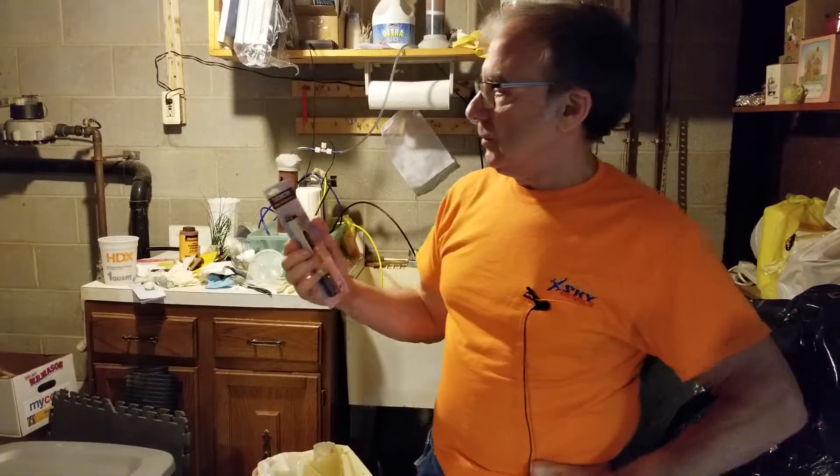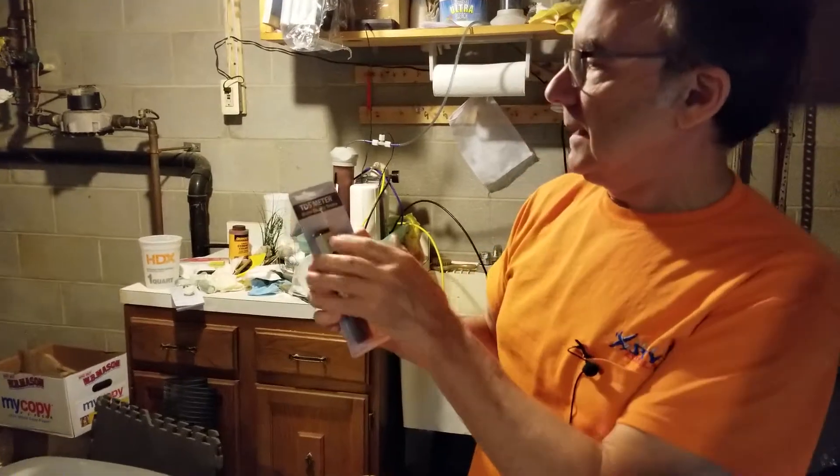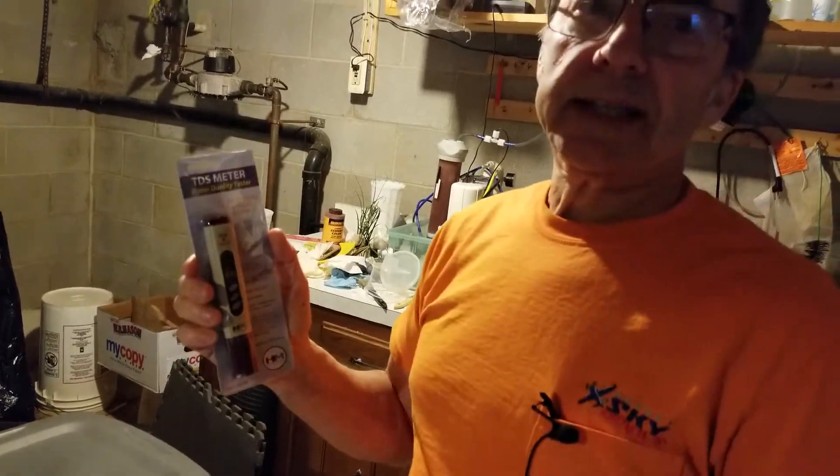Today we're doing a review of the HM Digital TDS Meter, model number TDS-4TM.